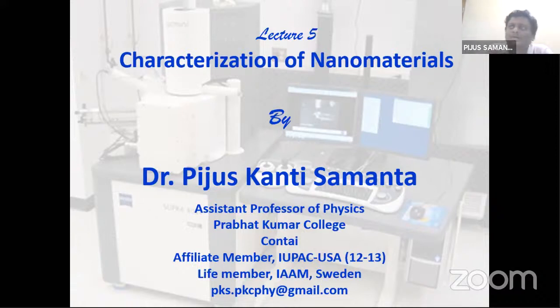Then we shall go for other characterizations, and we have to first analyze the entire X-ray diffraction pattern, because we have to find out the type of unit cell, if any kind of distortion is there, dislocation densities, particle size, etc. That I have already discussed in my earlier lecture. And then we should go for surface morphological studies that mostly include the electron microscopic images, the SEM and TEM.